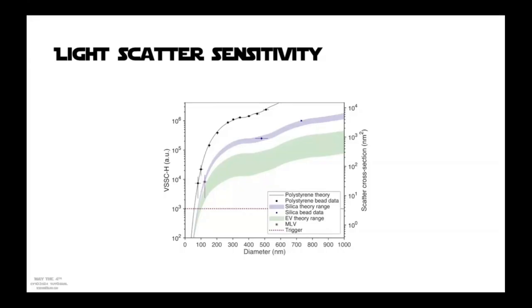And just something to add, the practicality of calibration means that for those of you who run a core, you know exactly the limit of detection on the instrument, down to the types of particles that people are interested in looking at. I have a lot of people that come to my core and ask, can your flow cytometer detect EVs that are a certain size? And I can confidently tell them, yes, my limit of detection is, for example, 80 nanometers for EVs and 60 nanometers for polystyrene.